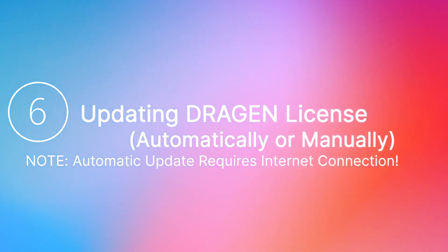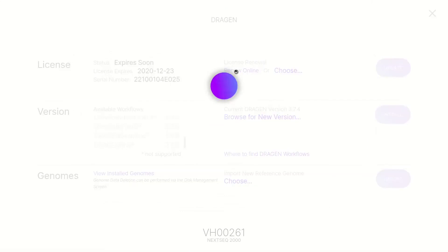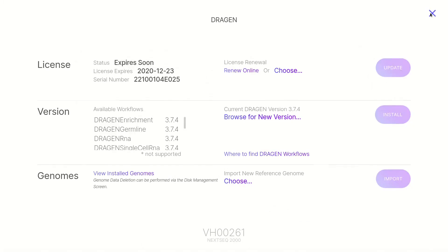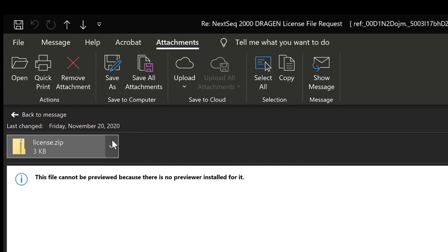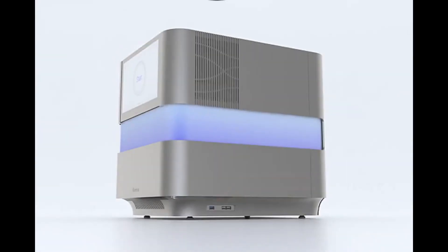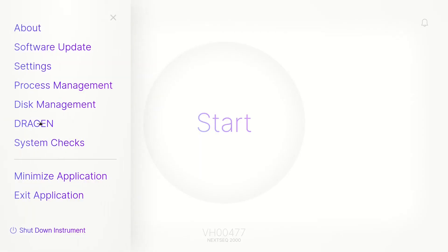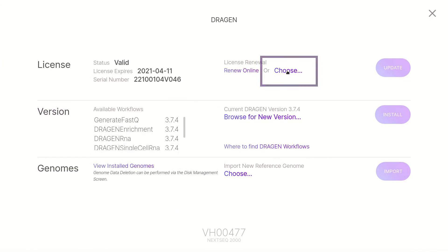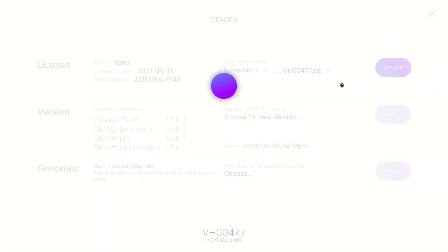Step 6: Updating the DRAGEN license, which can be done automatically or manually. To update the DRAGEN license automatically, note the automatic update requires an internet connection. Continue onto the DRAGEN screen and under License Renewal, select Renew Online. To update the DRAGEN license manually, first contact Illumina Technical Support to obtain a license key. Save the license.zip file to a local or portable drive. If you saved the license.zip file to a portable drive, plug the drive into a USB port located on both the side and back of the instrument. Back in the control software, on the DRAGEN Setup screen, under License and License Renewal, select Choose Offline and navigate to the folder location with the license.zip file and double-click the zip file. Then select Update.